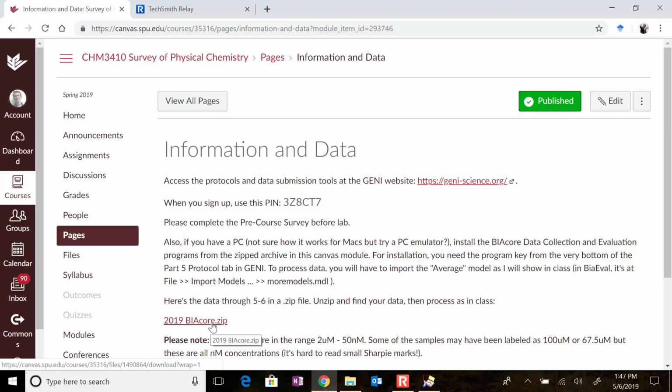And so for all the people who've collected data over this weekend, your nanos and micros are right. Just make sure that your micro should only be 1 or 2, and your nanos are going to be in the hundreds, maybe down to the 50s at the lowest.